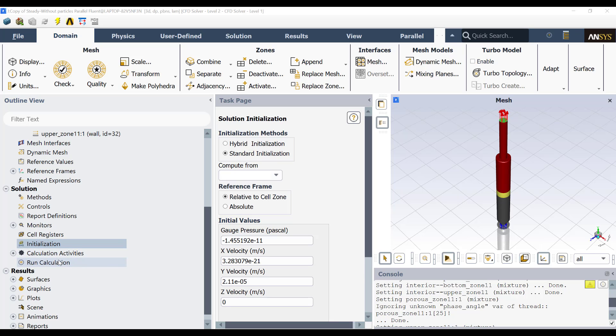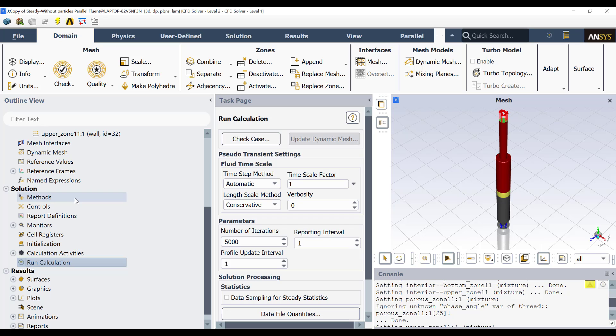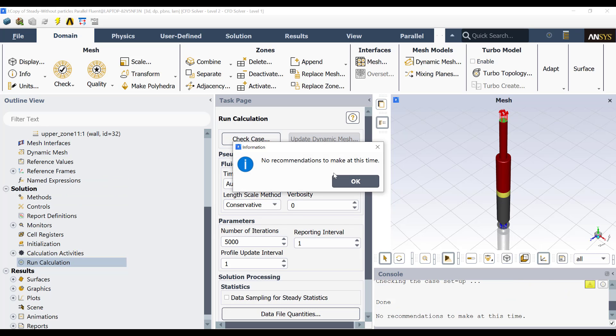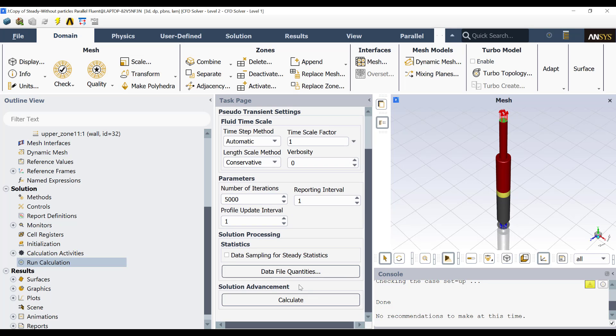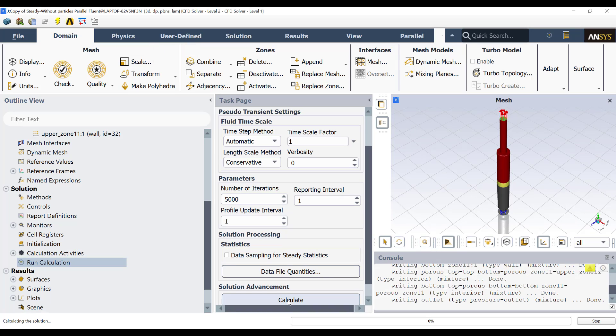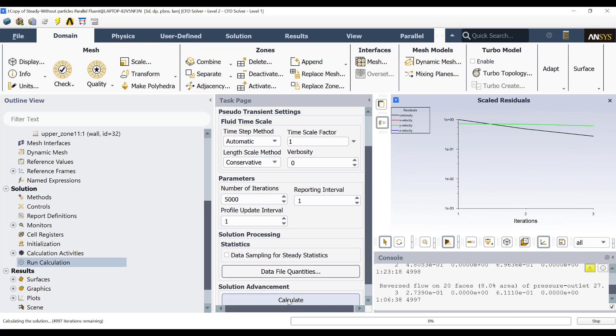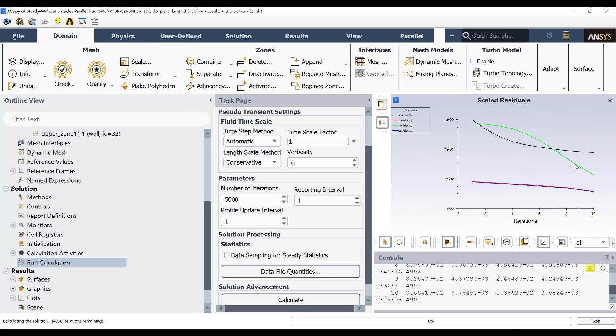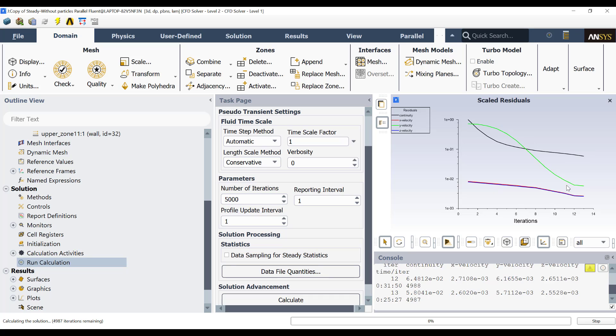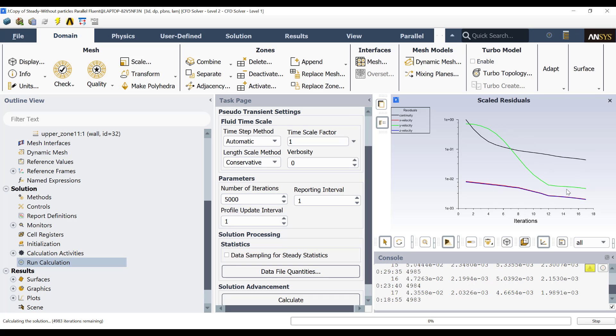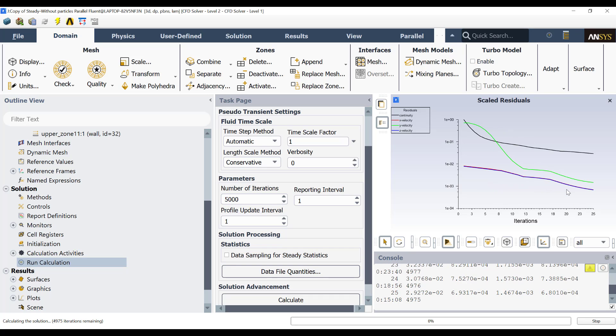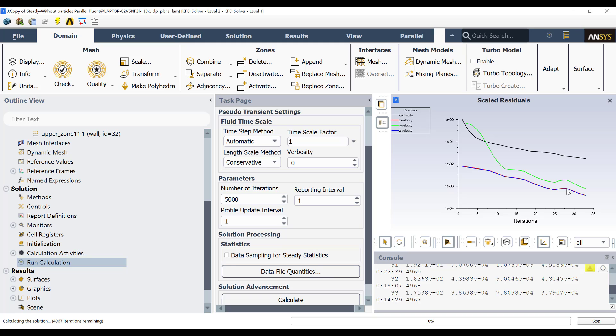Then that's the reason I recommend to use the standard initialization. Then once you have all the model complete, then you check the case and no recommendation to make at this time. Then you run the case to see until it converges. Then let's click here and you will see how this moves very fast. Then we need to wait until the solution converges.